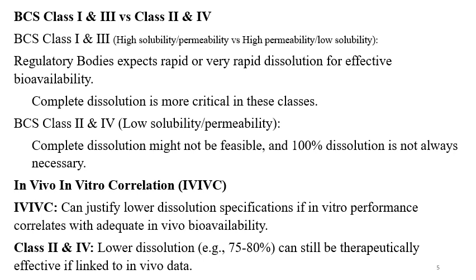BCS class you can consider here. BCS class 1 and 3 are highly soluble molecules. BCS class 2 and 4 are low soluble. So regulatory bodies expect rapid and very rapid dissolution for effective bioavailability. Complete dissolution is more critical in these classes. BCS class 2 and 4, low solubility, low permeability. So complete dissolution might not be feasible and 100% dissolution is not always necessary.